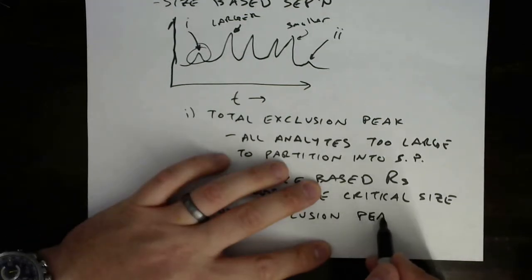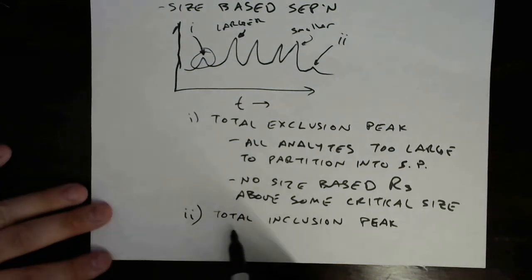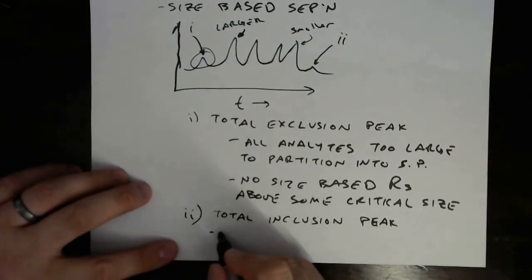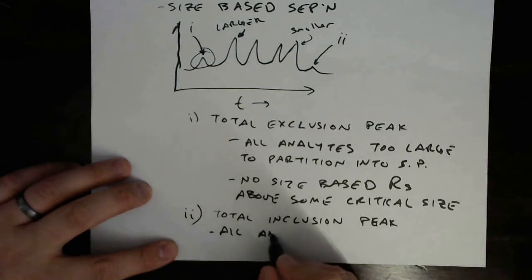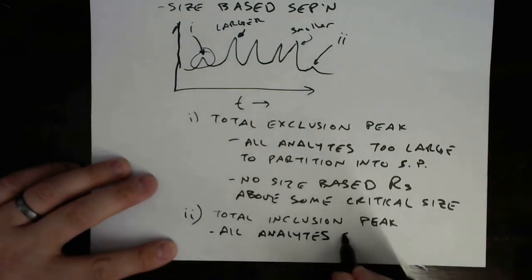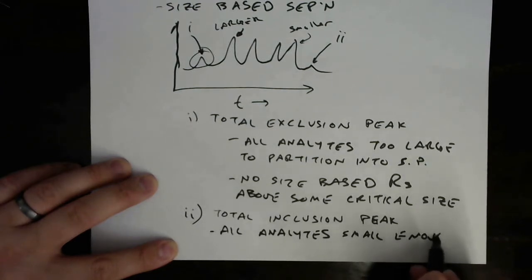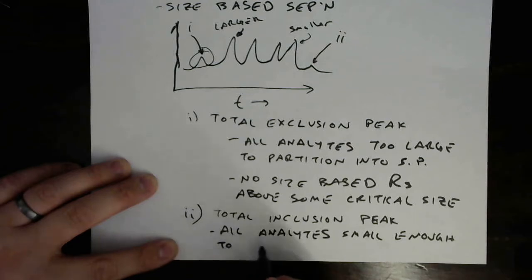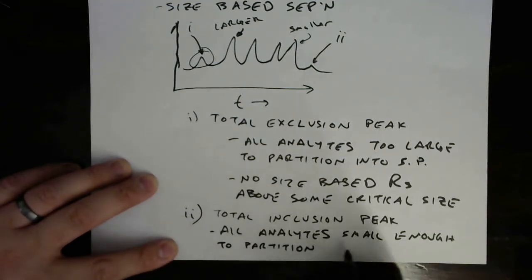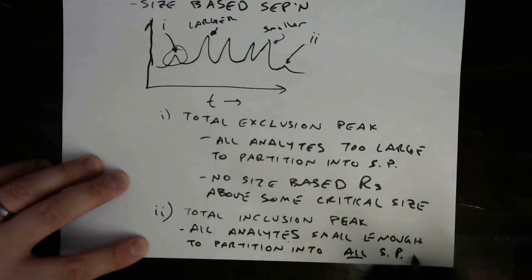And this is basically all analytes small enough to partition into all stationary phase pores.